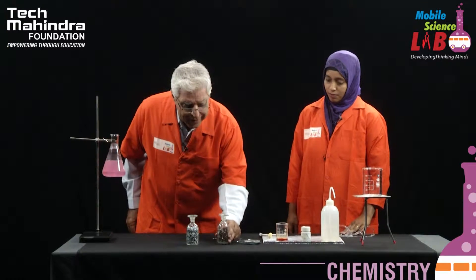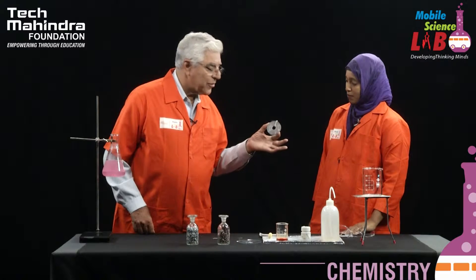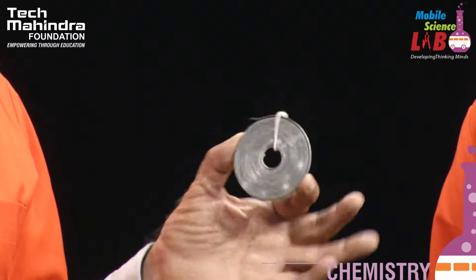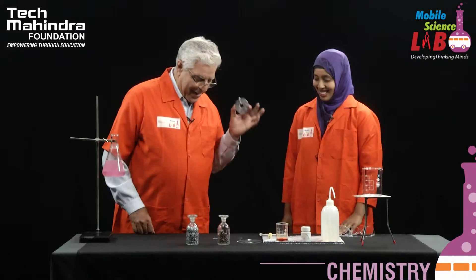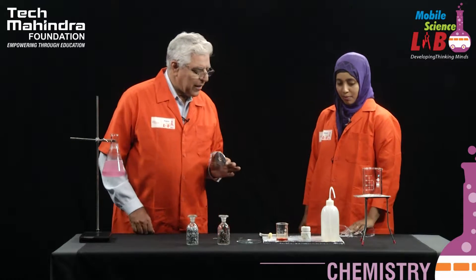Now the third one is a very familiar metal — not so common for non-laboratory people, but very common for laboratory people — and this is magnesium ribbon. You know magnesium ribbon quite nicely; one of your favourite experiments, that's right. Now, if we put these metals in water, I would request you to fill up some water.